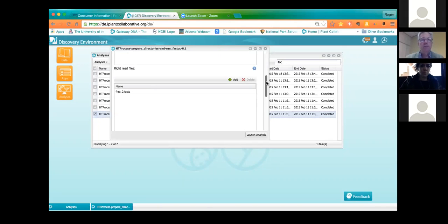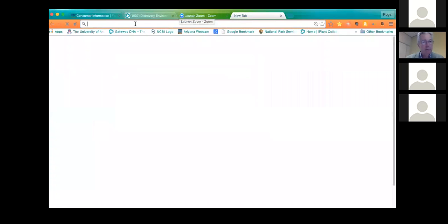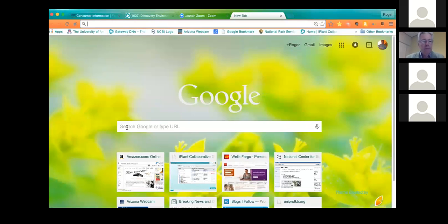If you're interested, the frag data represents genome reads, genome sequencing for Rhodobacter sphaeroides, and that data can be found in the discovery environment. But I just wanted to take a slight diversion here and show you. If you have a question about anything, and in this case I can tell you that data came originally from the GAGE project, which has some nice sample data for genome assembly if you're interested in that, or if you just need some read files to play with.